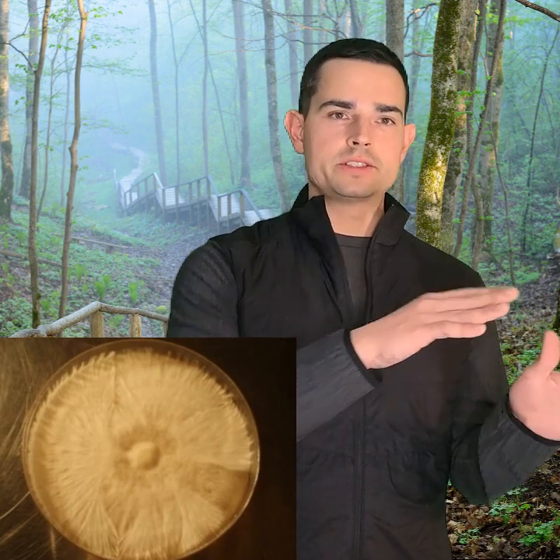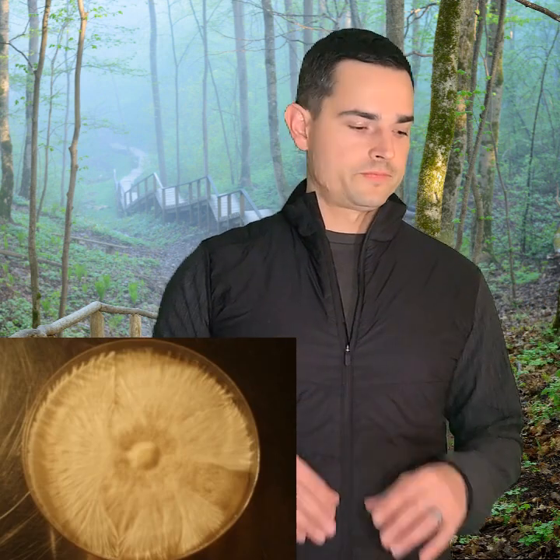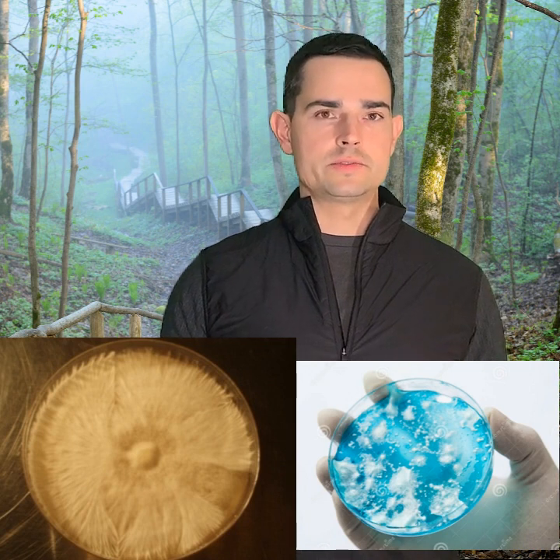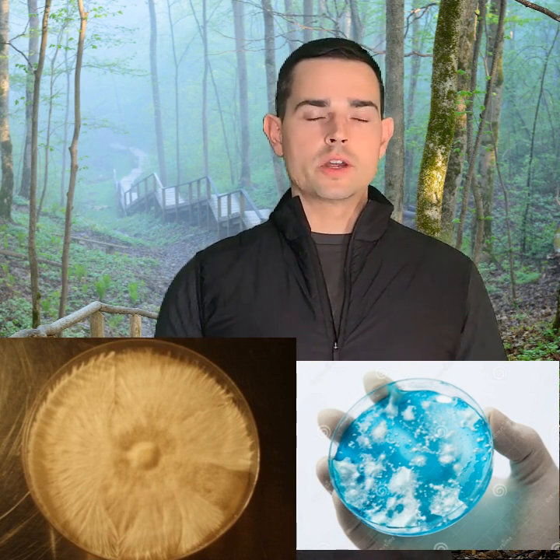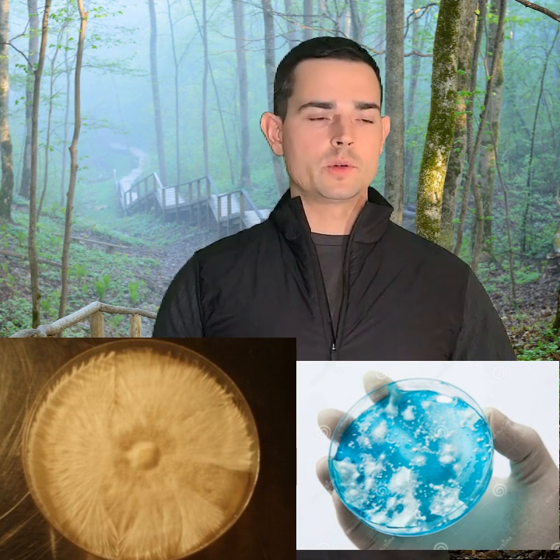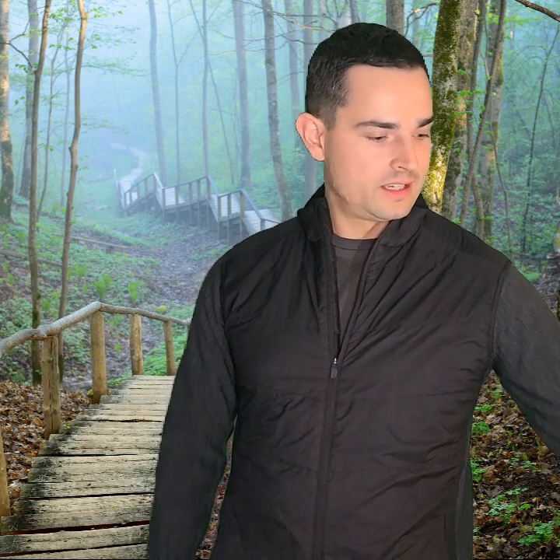What you're basically doing is ending up with a cleaner culture. Whereas with spores you're just injecting whatever — it doesn't matter how great your all-in-one grow bag or grain jars are, if they're sterilized properly but you have dirty spores, your chance of contamination is probably 15 to 20%. You want to bring that down to a negligible five percent, or even zero-point-something.